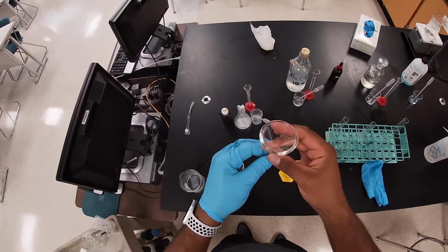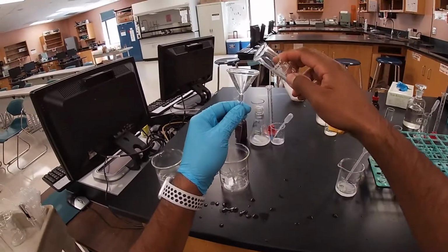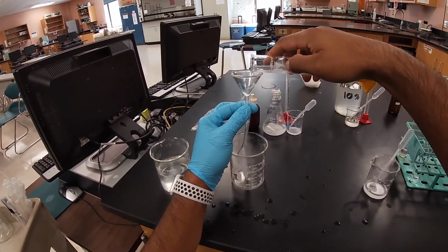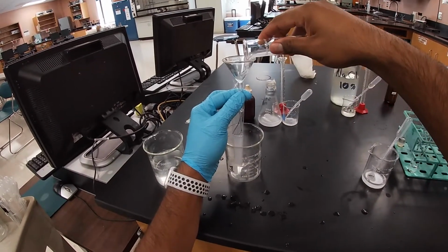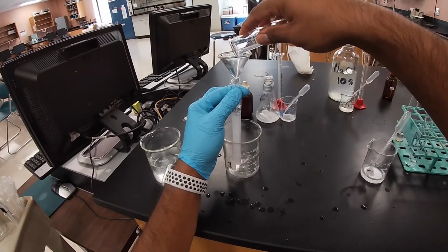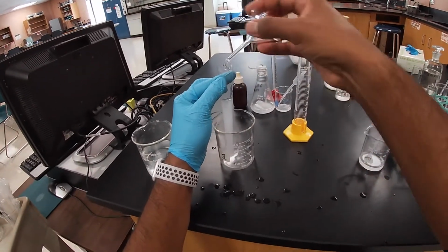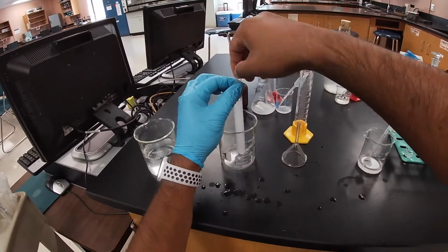All right, and as we open it, now we're gonna get our 20 milliliters of our mixture. And just go ahead and put it in our container where we're gonna submerge our stuff. All right. And so those are our 20 milliliters. And if you notice, I gave myself enough slack. So we're gonna go ahead and tie the other end now.